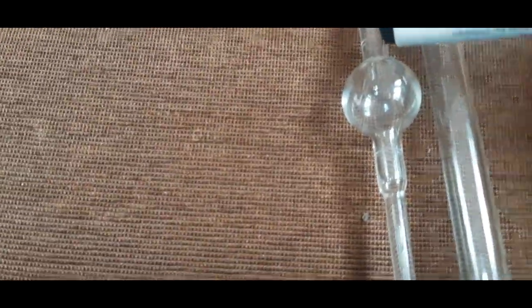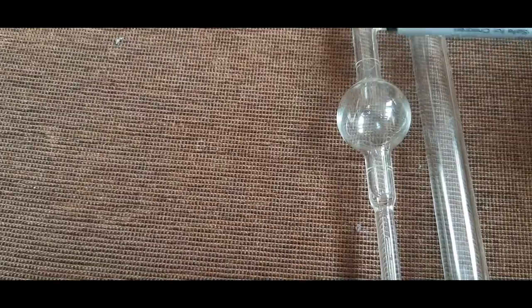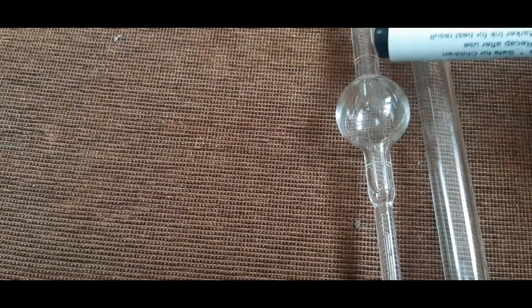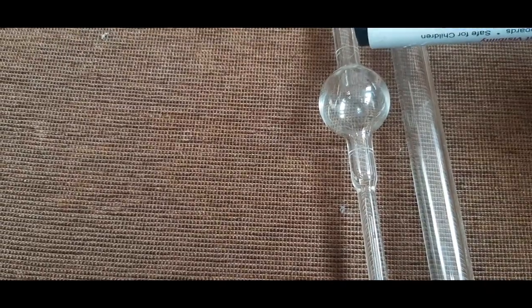You could see 2 markings here, upper marking and lower marking. You have to adjust the liquid to come to the upper marking, and after that start your stopwatch so that you can find the flow time for it to flow from this marking to this marking.